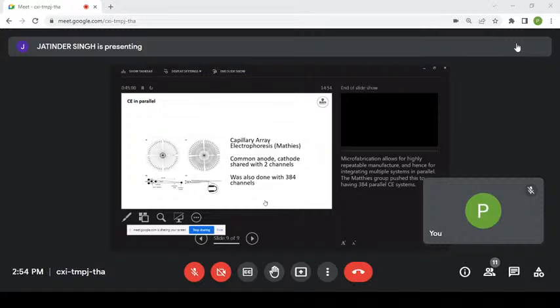So this is a single CE chip. It's got one injection point in there, one separation channel. Depending on how good your computer drawing skills are, if your computer drawing skills are reasonably up to scratch, you can actually get exactly the same channel geometry with a bit of fantasy into a very small footprint.